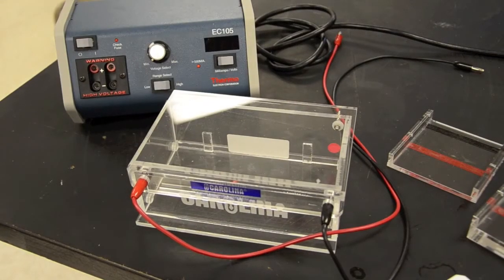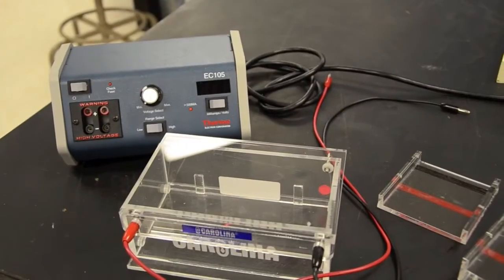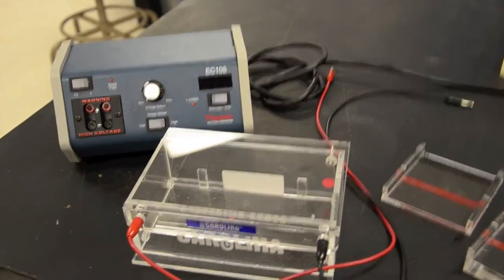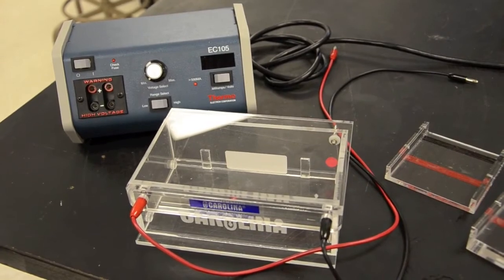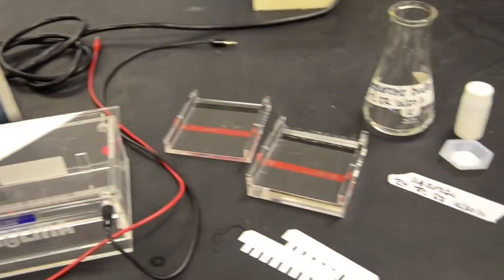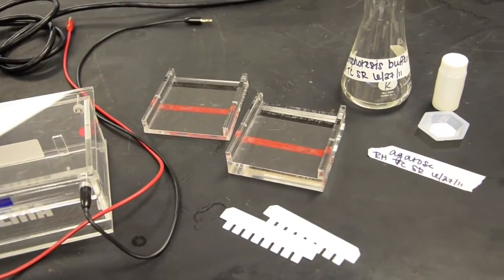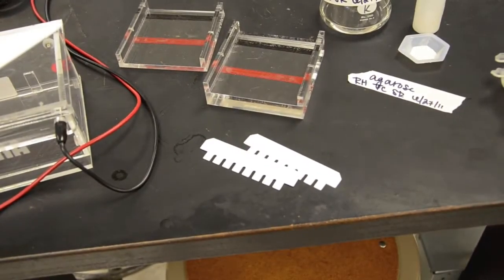Now I will list the items you'll be using today. This is the power supply followed by the electrophoresis chamber. Next we have two gel beds and below that the gel combs.